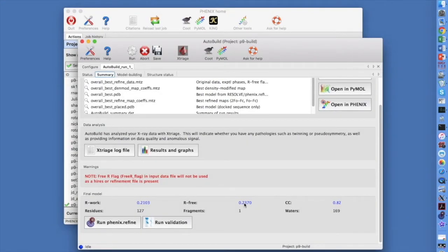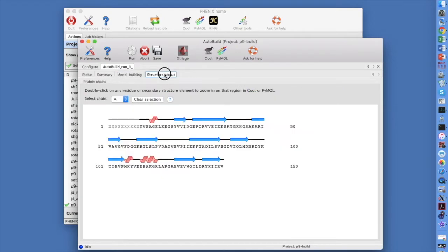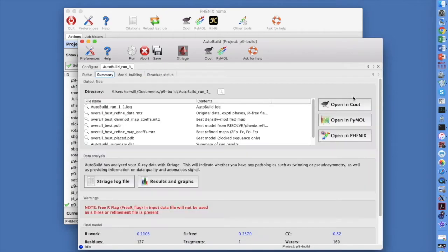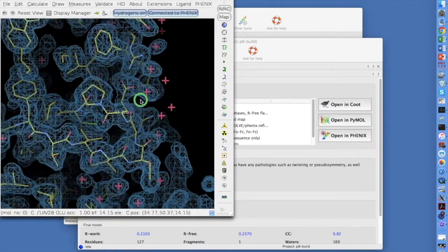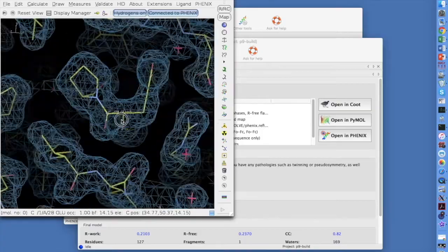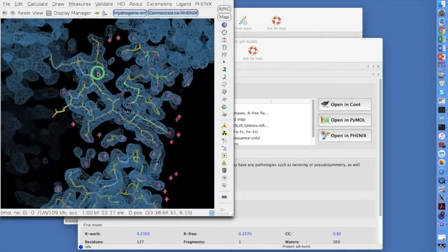In the Auto Build GUI, the Models tab shows a summary of models built during the run. The Structure Status tab shows secondary structure in your model. The Summary tab is an Open and Coot button that will load the final model and map. This is a fine model and map for 3 Angstrom data.